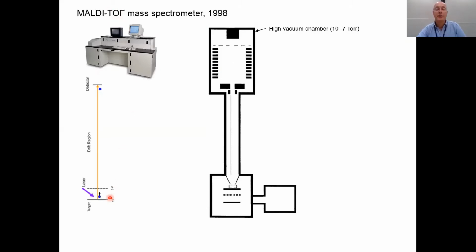And it's not difficult to work out how a TOF tube works. We accelerate our ion in an electrical field and then it will drift down the time of flight tube until it hits the detector, and we will measure the time it takes for that to happen. We can measure time extremely accurately electronically, and then we can use that to derive the mass to charge.